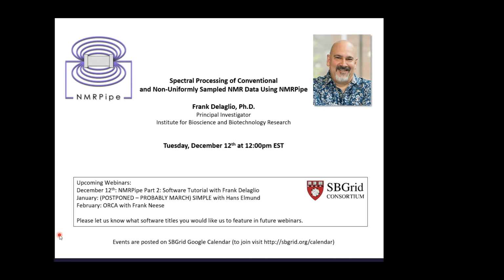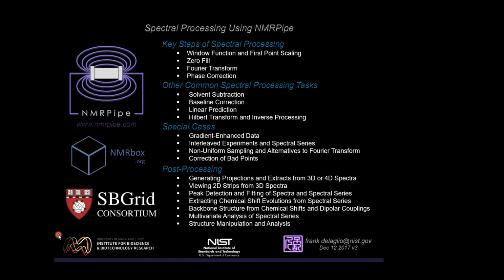After a quick technical check, systems check for the SB Grid folks. All well. Systems look good for me.